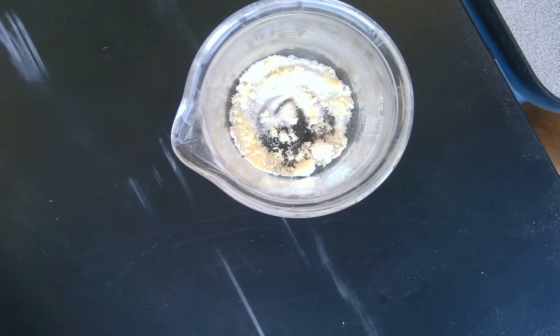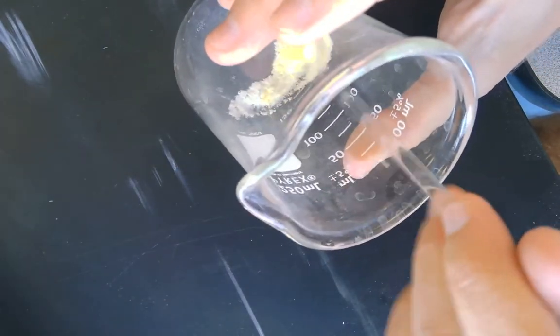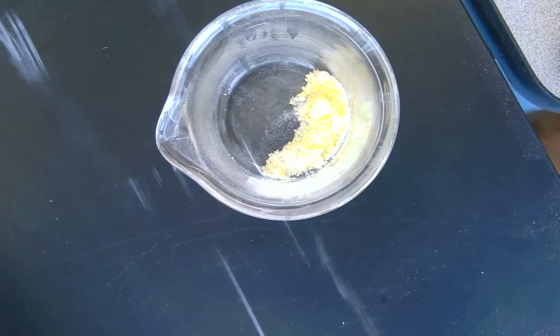Let me turn that lamp off. Yeah, you can see there's a little bit of color to that, right? Not a lot, but there is a little bit, but none before I stir it. And the more I stir it, I will get a little bit more color, but there's still not a whole lot, right? Because they have to collide. So as I stir them, I am helping them collide a little bit.